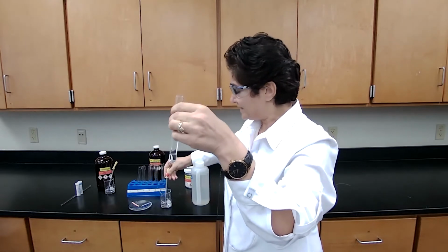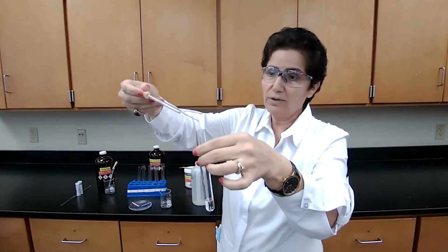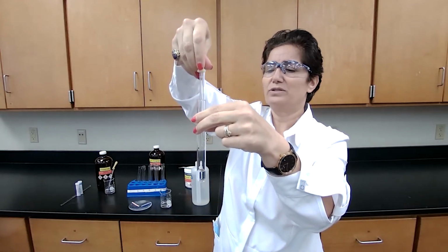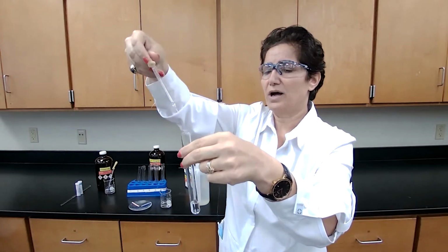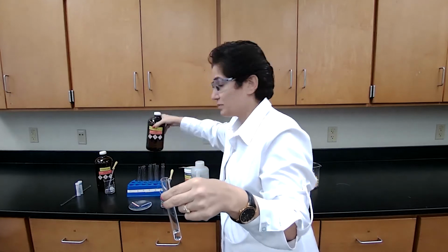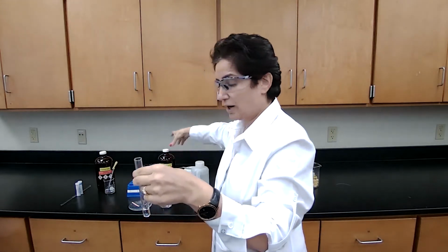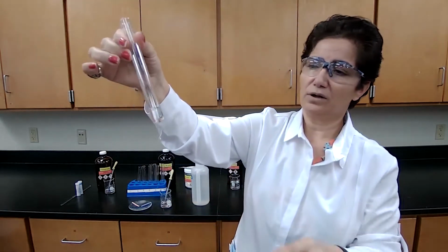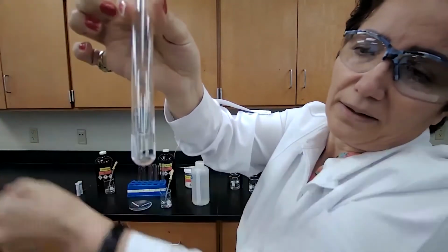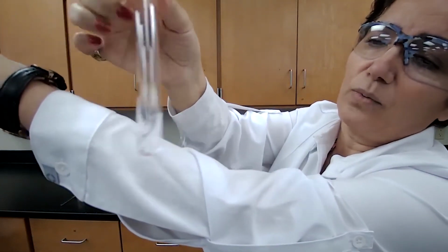Ethanol is a small molecule alcohol. It's very polar, so we know that it's going to dissolve, but it would be a good test for you to see what it looks like when it dissolves. Based on the procedure, we add 2 drops of the ethanol, and that's what I have, ethyl alcohol, or 95% ethanol, and I added 2 drops. When I add the drops of ethanol into the water, 1 layer forms, and I hope that you can see it with the white background or black background, whichever we need. So you could see that it is 1 layer.